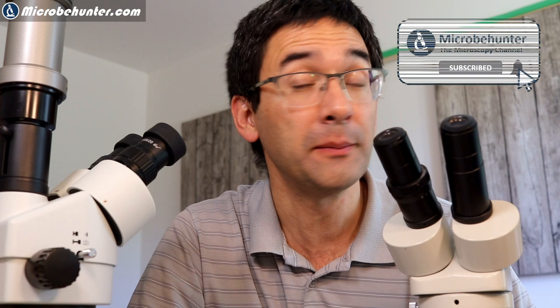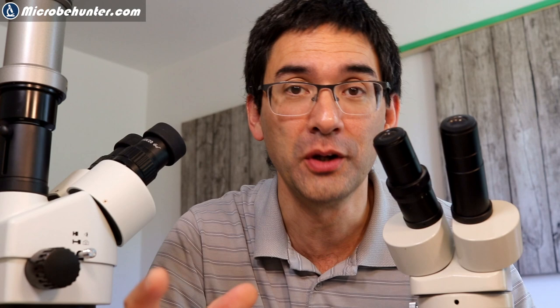Thank you for the question. I'm going to add a few more points. I'm not only going to talk about the differences between stereo and compound microscopes very briefly — I made separate videos on this because there seems to be some confusion. I'll also address connecting a camera, the brand of stereo microscopes, size and zoom ability, and the type of illumination.